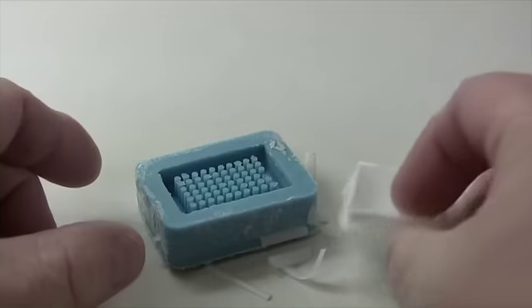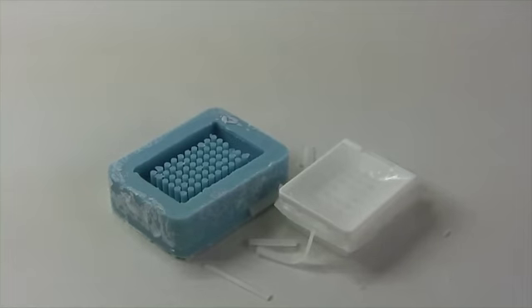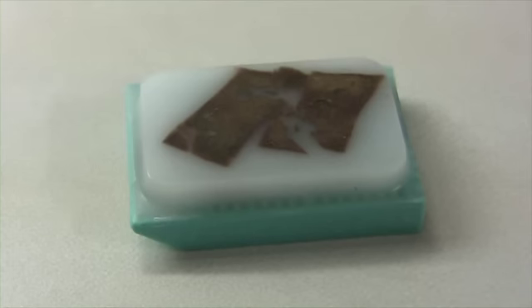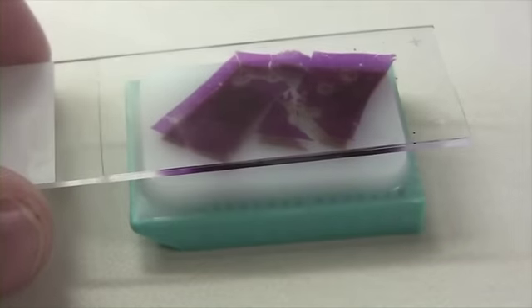The array mold we're using here is one of our first created. As you can see, it came to us with a short core rod in it. Since we couldn't sell it, we've been using it for our testing. In the last 3 years, I believe we've made around 40 to 60 paraffin arrays with this single array mold.